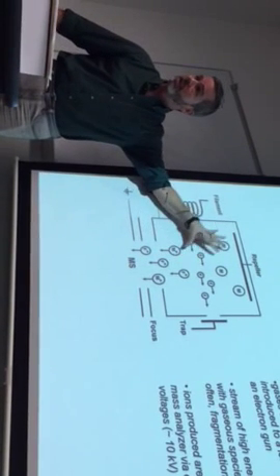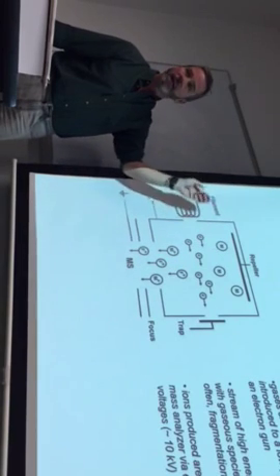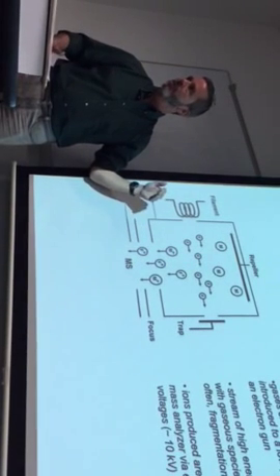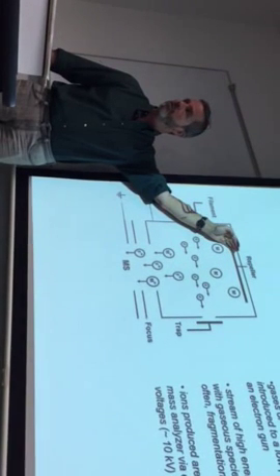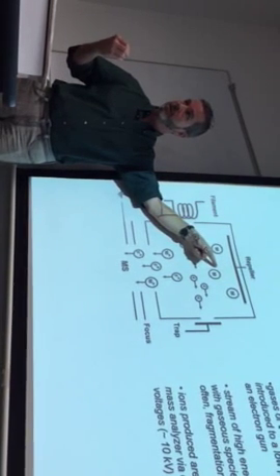So everybody good? You generate ions. And now where are these ions? They're inside this ion source. And check it out now. From top to bottom, as depicted here, we have some electro-optics. It's a general term. Here up top is an electrode called the repeller electrode. It's held at a very high positive voltage, repelling cations in, correct?